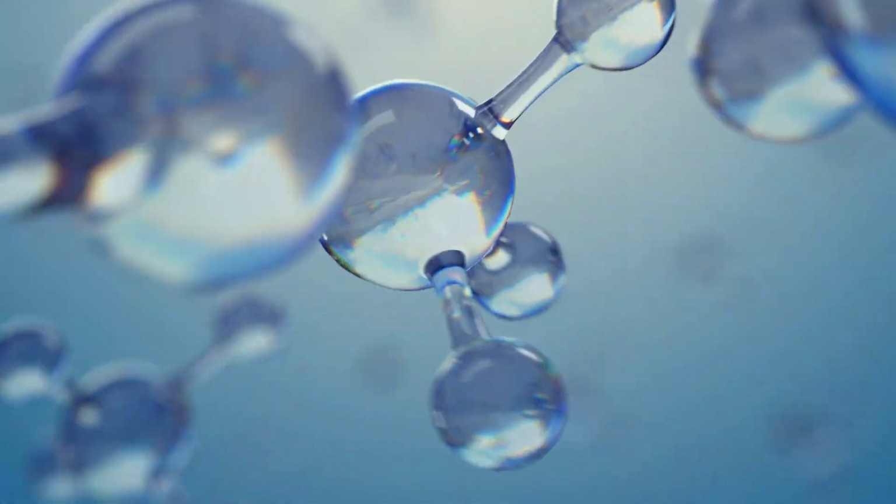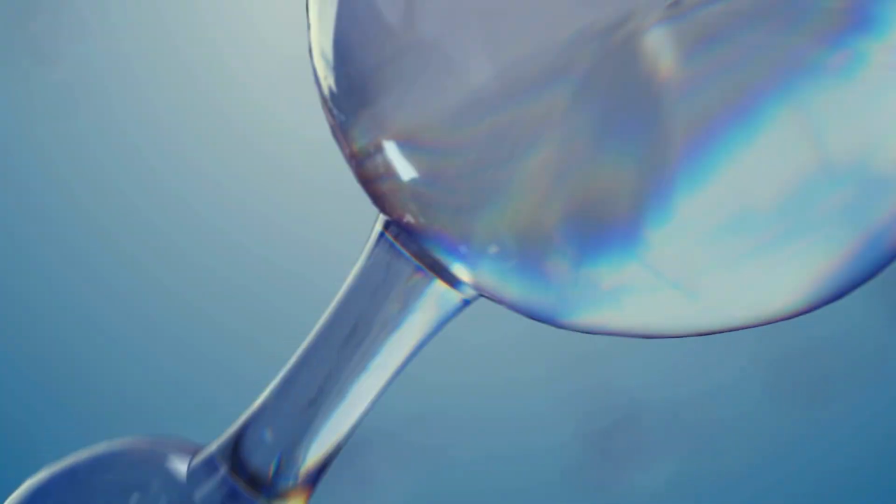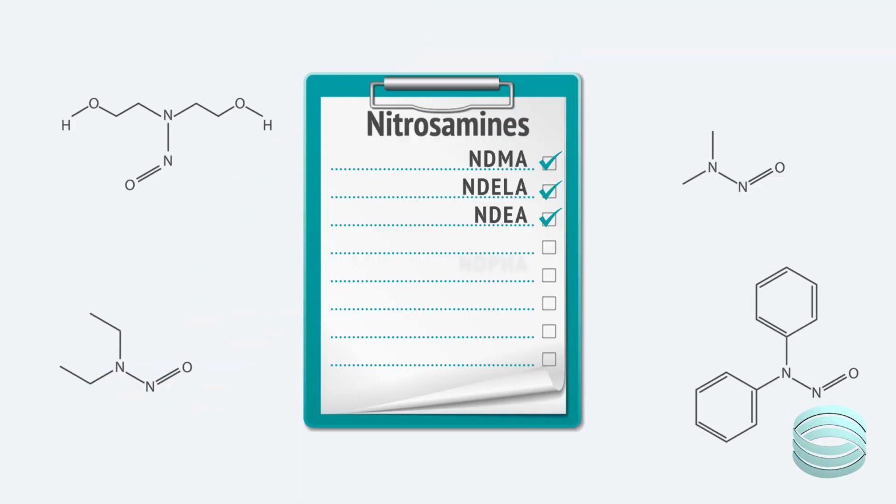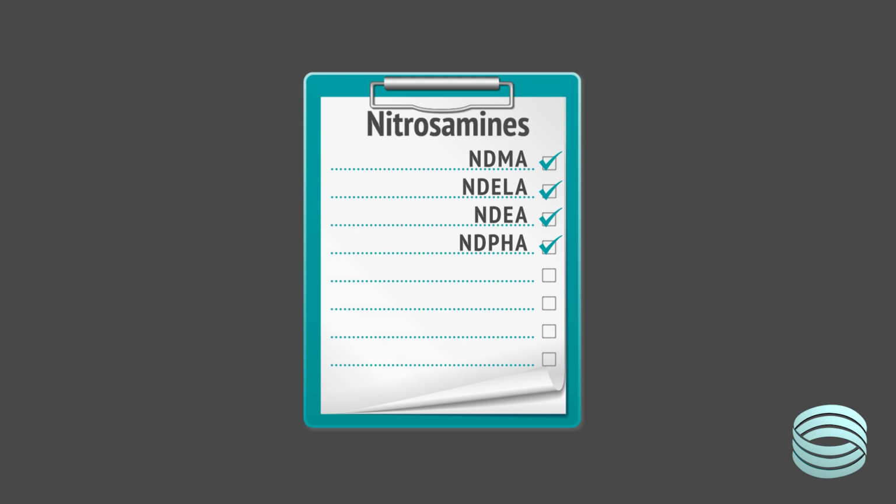Why does this happen? Well, the answer lies in how GC-MS-MS and LC-MS-MS detect nitrosamines. These techniques rely on targeted analysis, meaning you need a reference standard for every nitrosamine you want to quantify. If a new or unknown nitrosamine is present in your sample, but isn't a part of your standard mix, it won't be a peak of interest that you would be able to quantify.